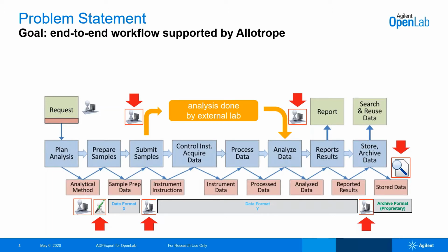So how can I store my data safely, retrievable, and even ad hoc usable or accessible over many years or even decades? There is no satisfying answer today, and often a tedious search has to be started. And in many cases, we know analyses have to be reworked from scratch, and this means a lot of costs in time and lab resources.